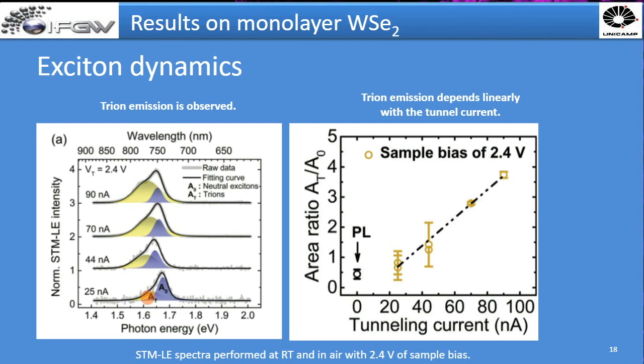And if you're doing photoluminescence, so you create the pair, the doping of the sample, or the extra carriers the sample has, can have a little effect.